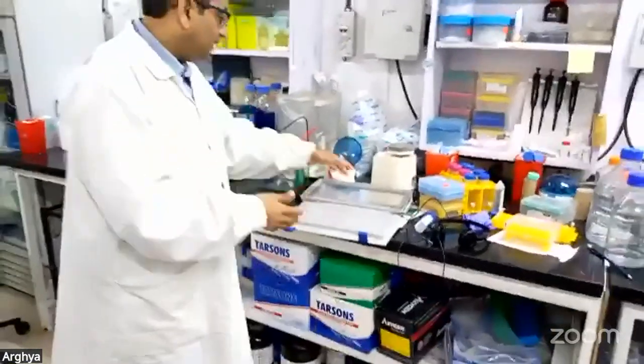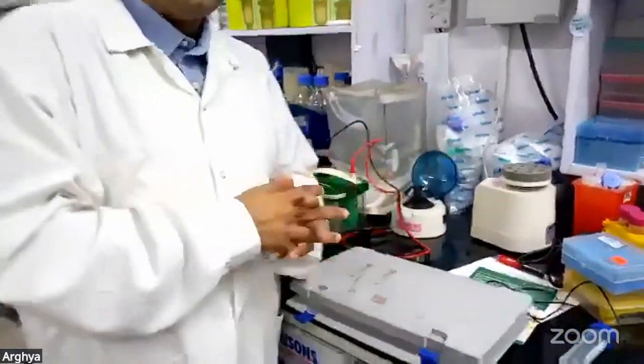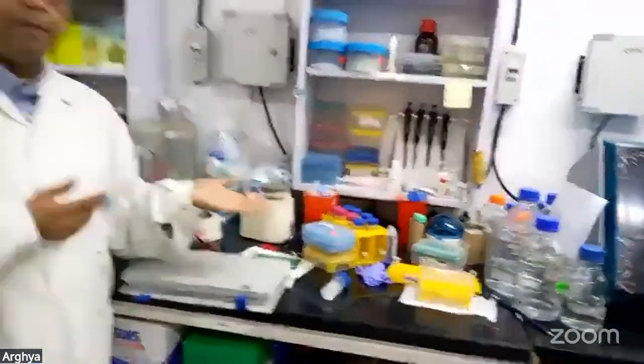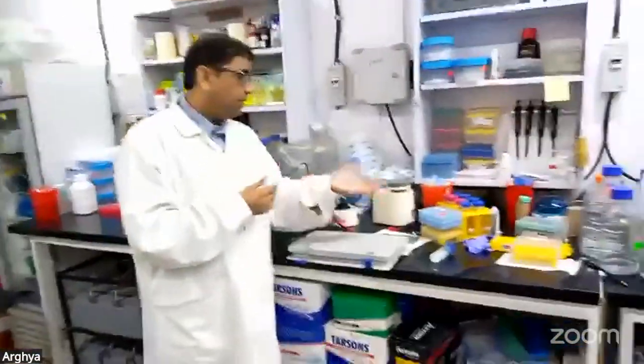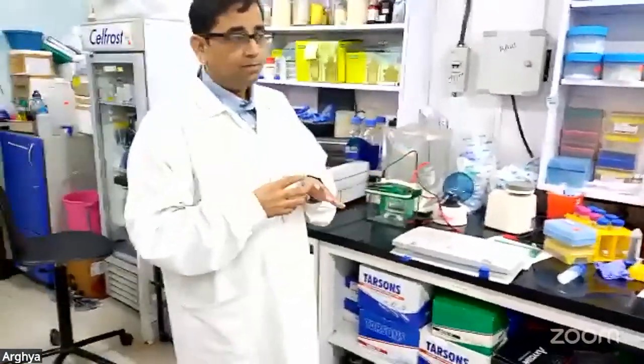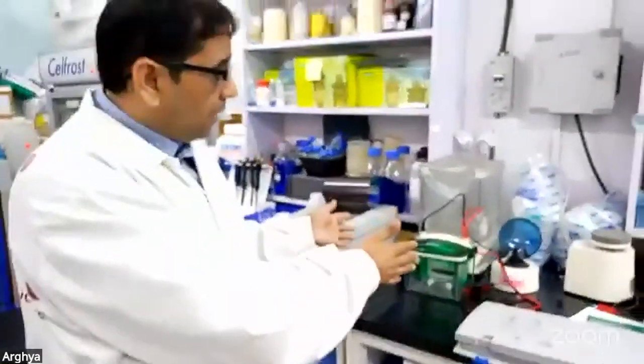Once we have done that, we take our IPG strip and clean it on paper wicks and tissue paper, and then we move on to the second dimension separation. What you see here is a very small 7 centimeter gel, but ideally, the goal is to look at the large 2D gel separation.